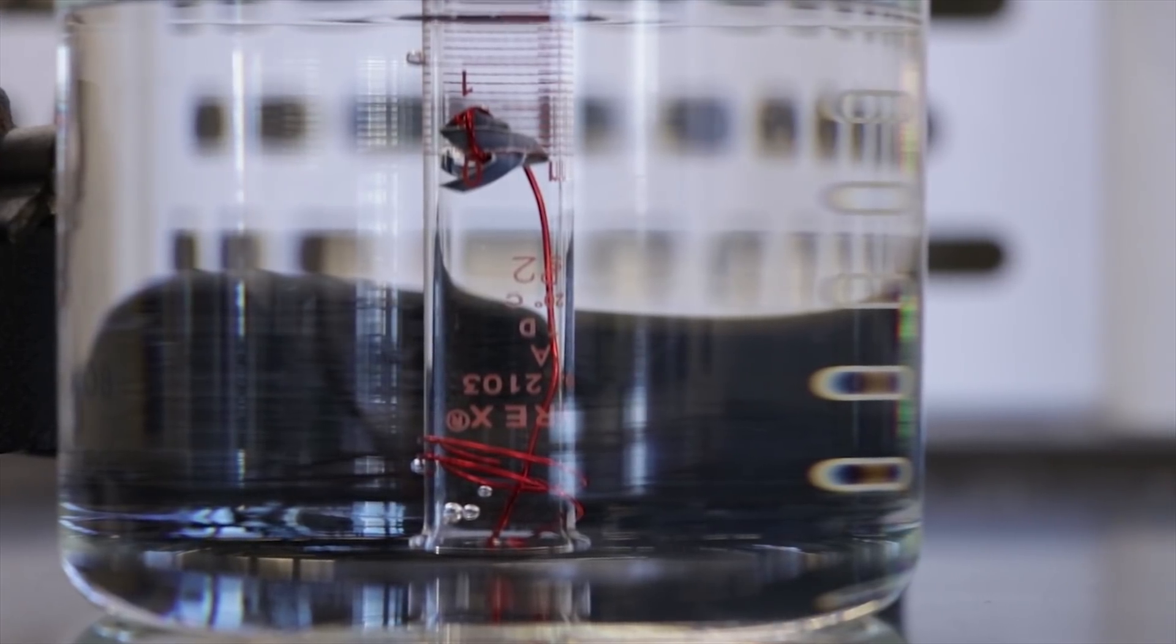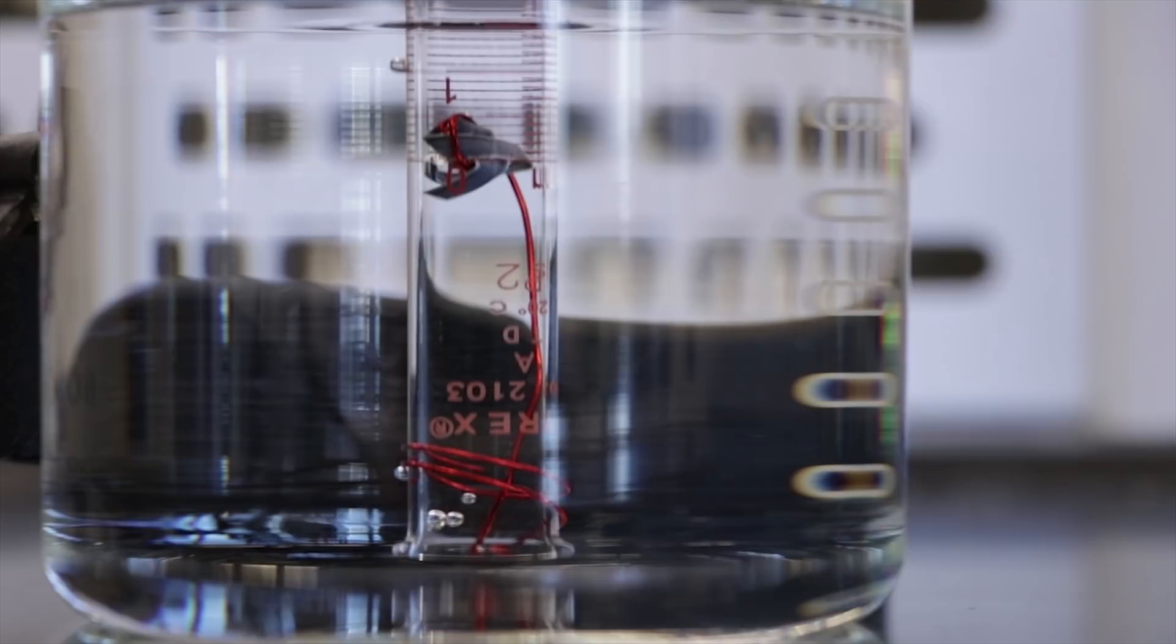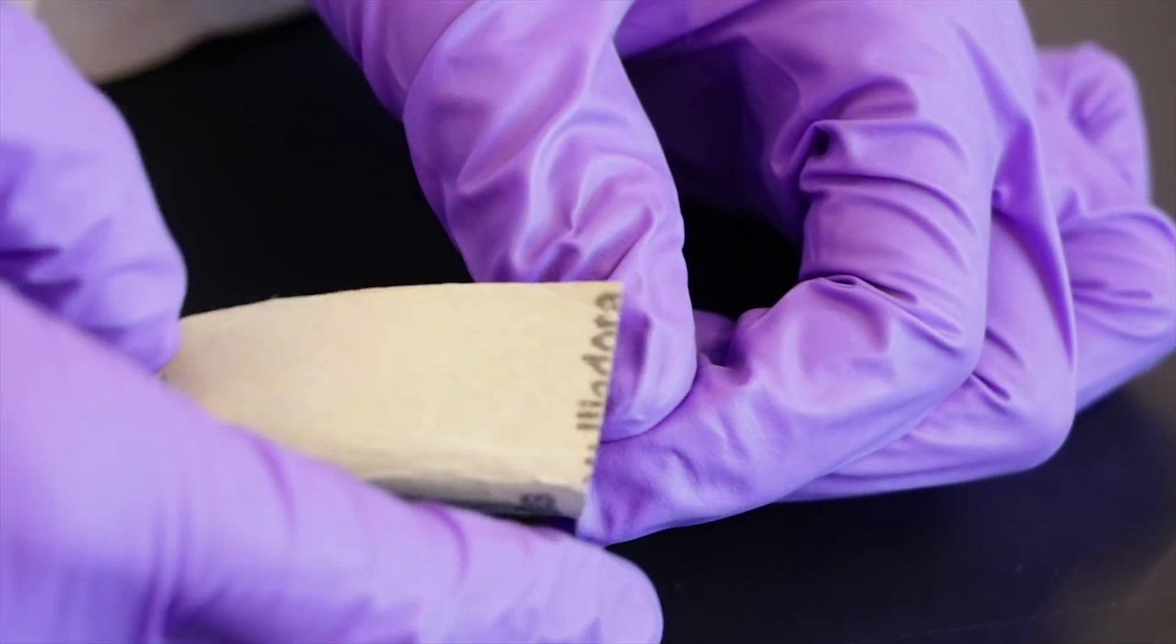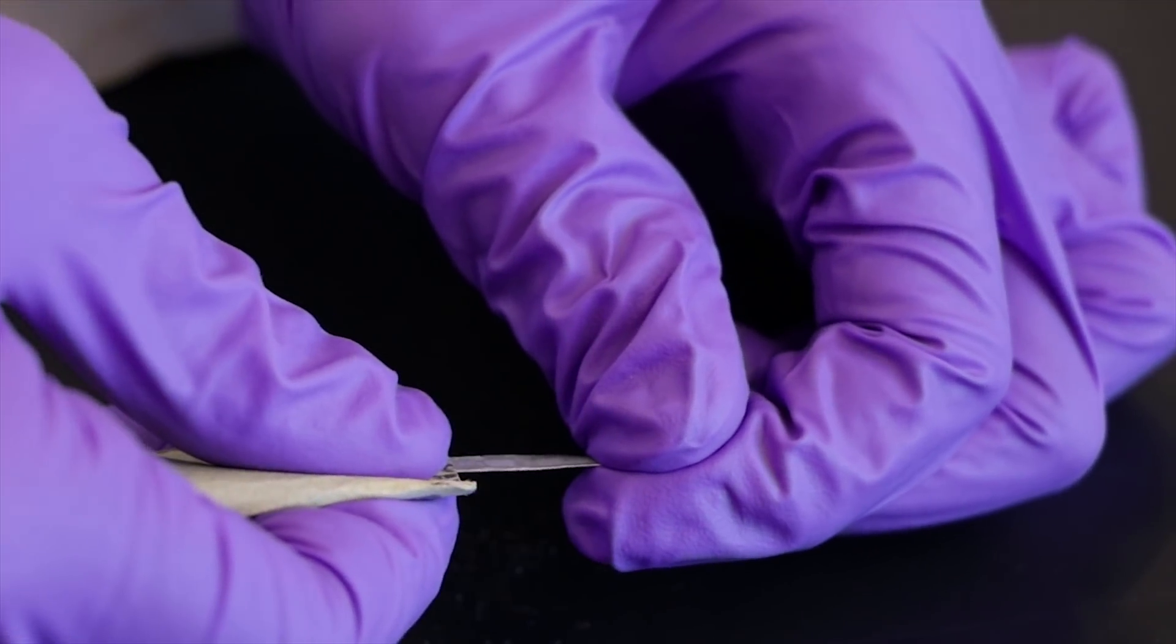If some of the magnesium attached to the copper wire remains unreacted at the end of the reaction, it is an indication that the oxidized layer of the ribbon was not completely sanded off.